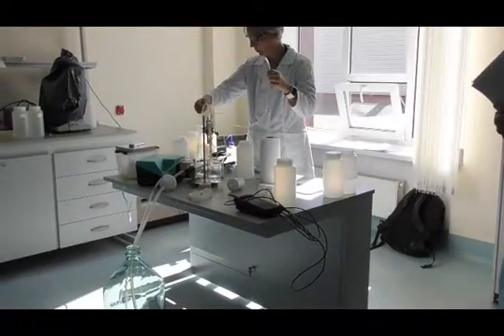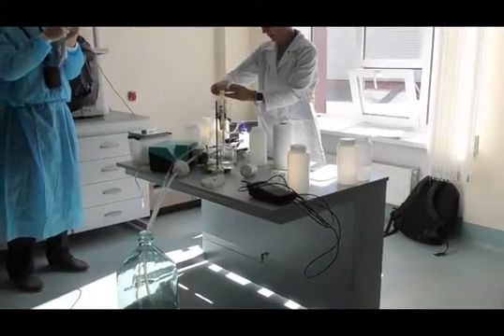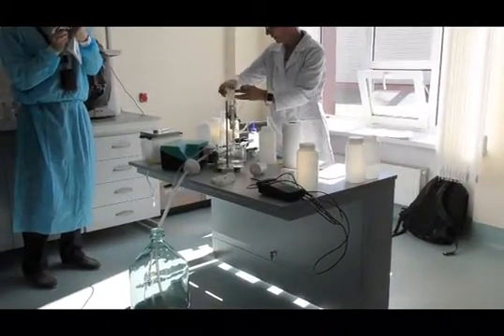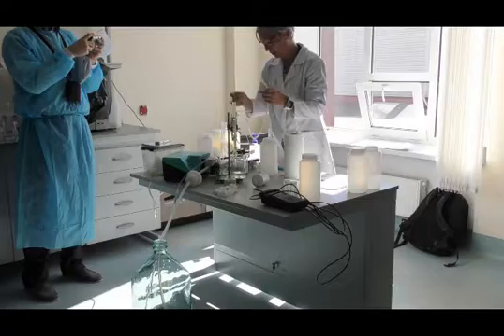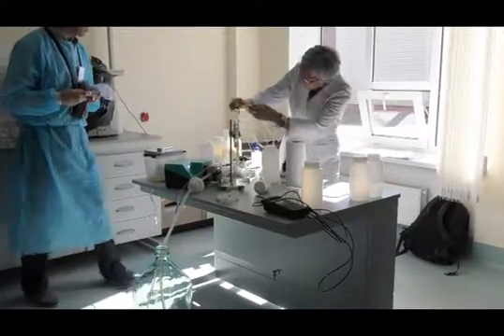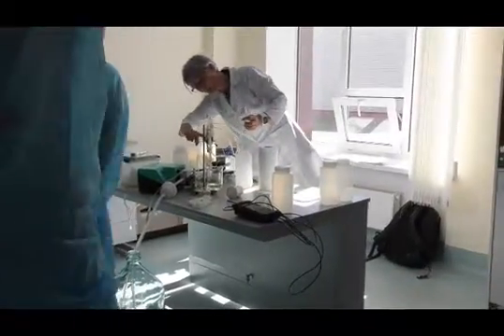So we put a little pressure here, just to squeeze. And I have measured the pressure here to make sure it's not too big, because I don't want to destroy the filter. Now you see this filter is very small and it's getting slow. But you see the sample is coming up now.